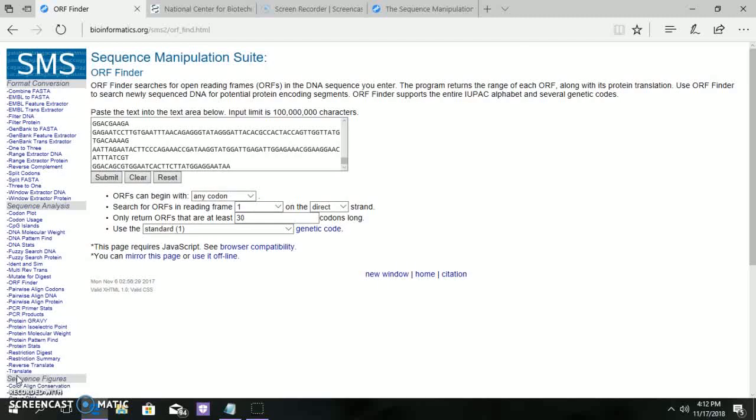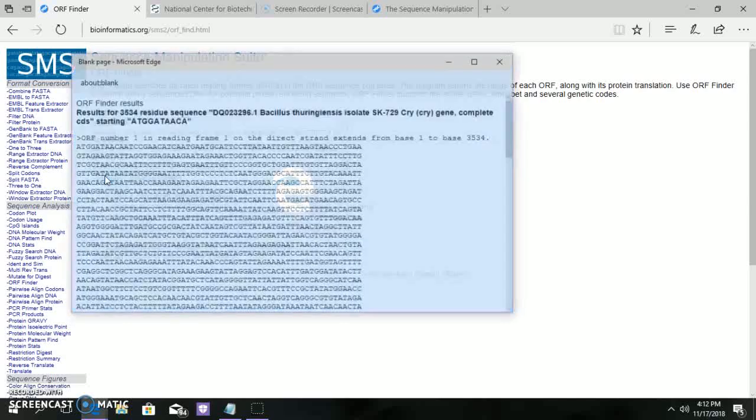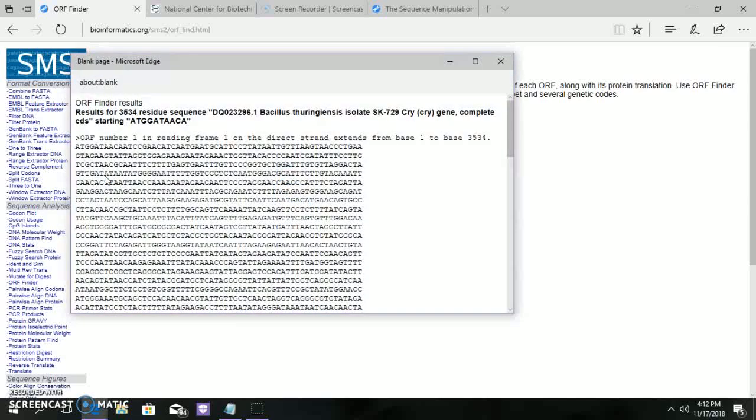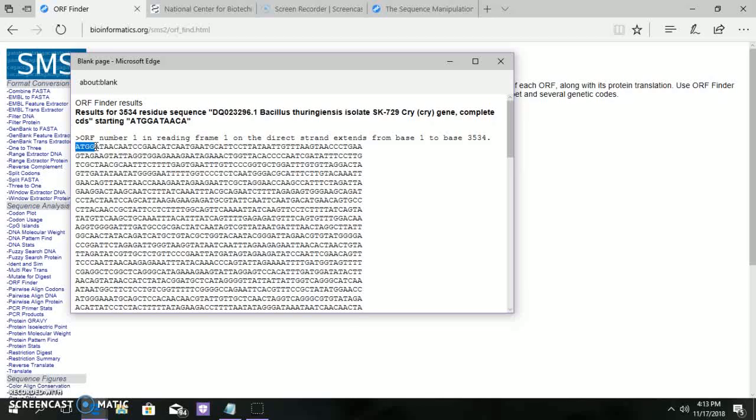Now about the ORF finder. ORF means Open Reading Frame. It is used to find the protein translation site. ORF is a continuous stretch of codons that contains a start codon and a stop codon. Here in the sequence, ATG codon within the ORF may indicate where translation starts.